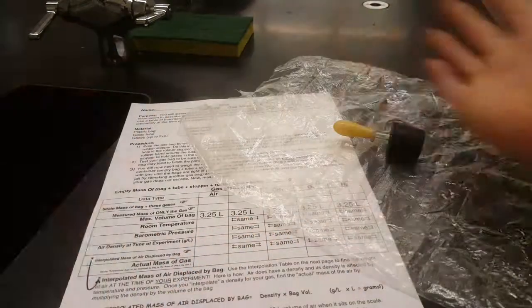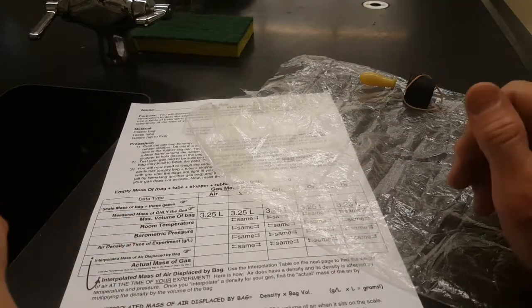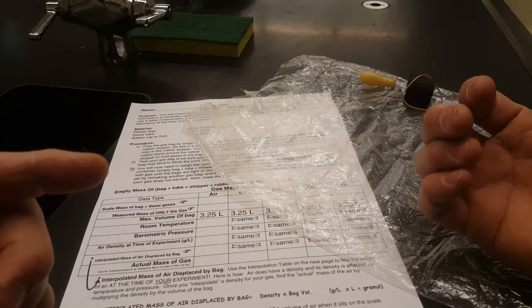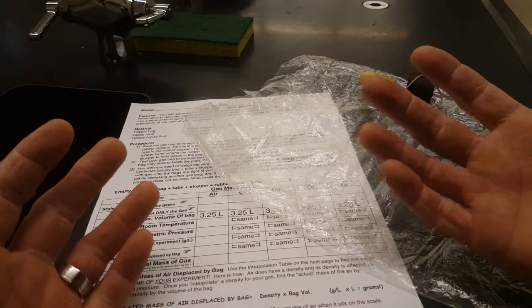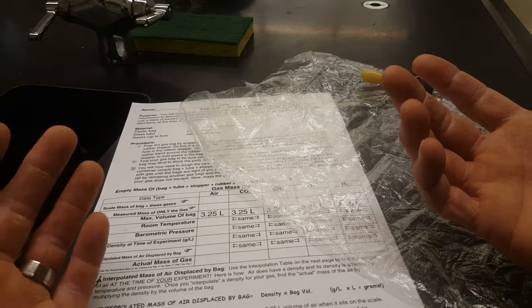Your job today is to mass gases, but there's a problem. Archimedes' principle tells us that if you're in a fluid, and this room is full of the atmosphere, and the atmosphere is a fluid, you will weigh less than if you are in a vacuum. If you're in a fluid, you have buoyancy. You will weigh less, equal to the weight of the fluid that you displace. So, for instance, if I displace 10 grams of air, then on a scale, I will appear to weigh 10 grams less than if I'm in a vacuum.